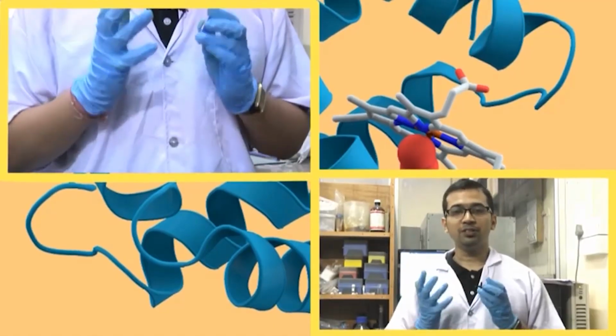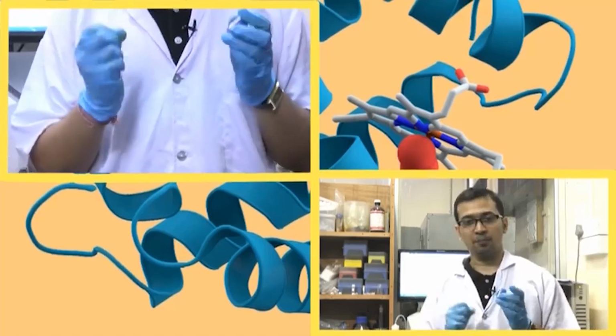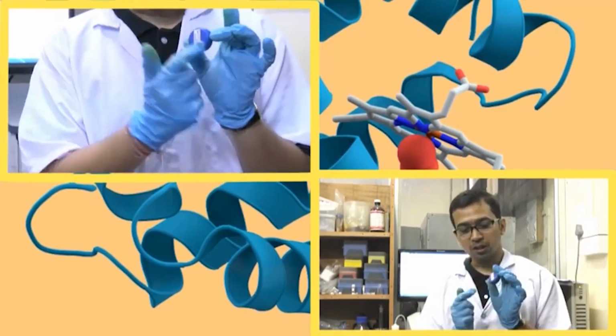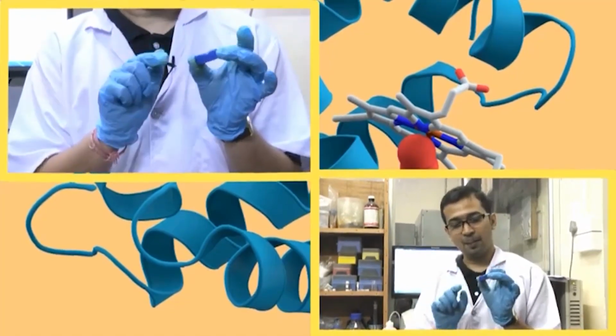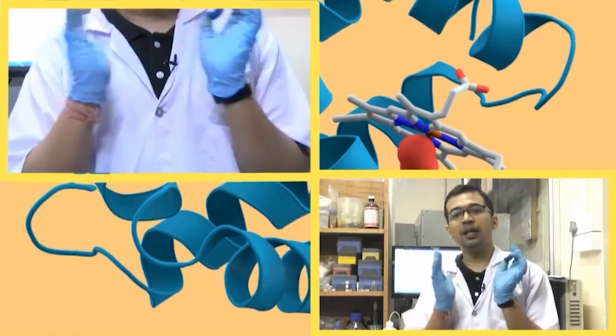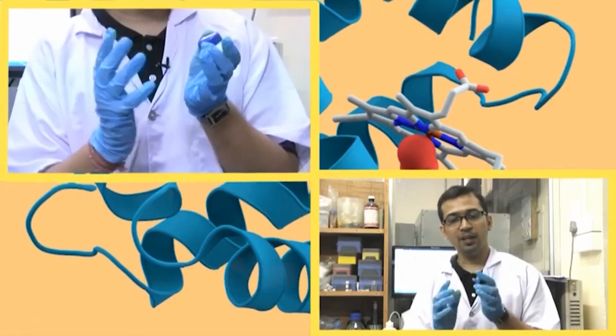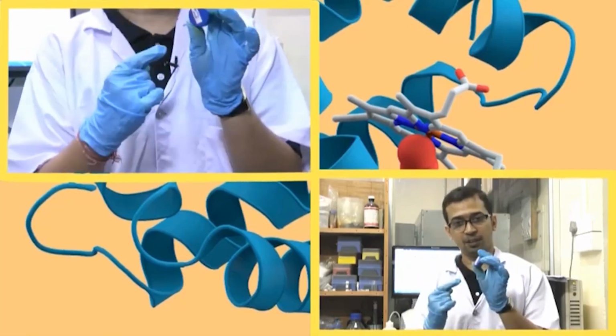In the cuvette, what is happening? The gallic acid is facing the light. Suppose this cap of the falcon is my example, and this entire room is a cuvette in which there is a molecule of gallic acid.